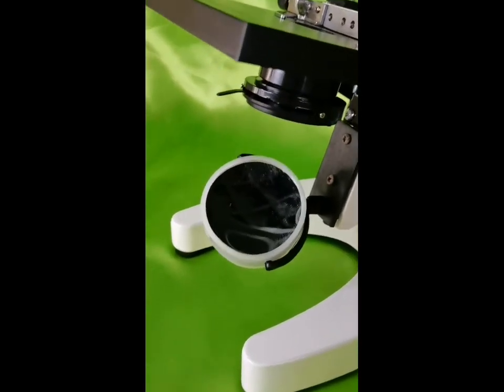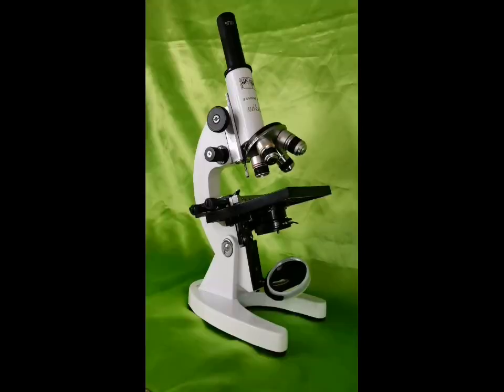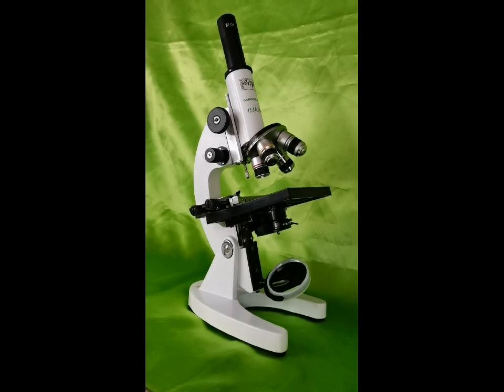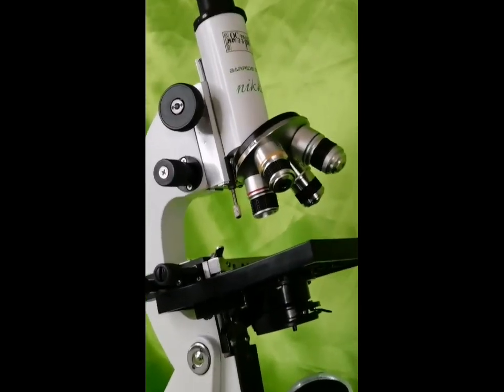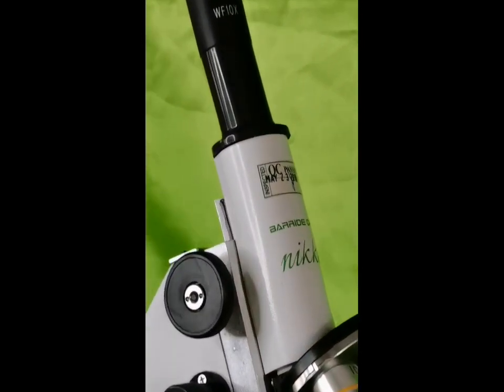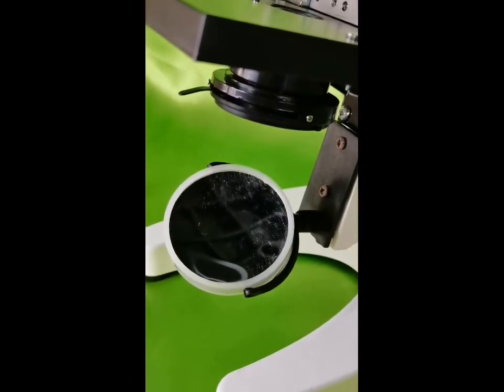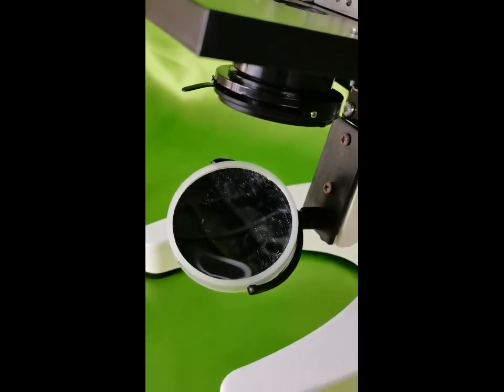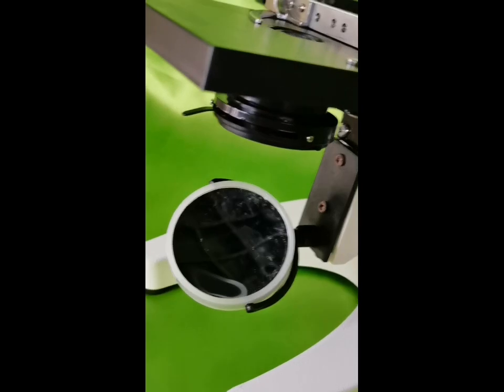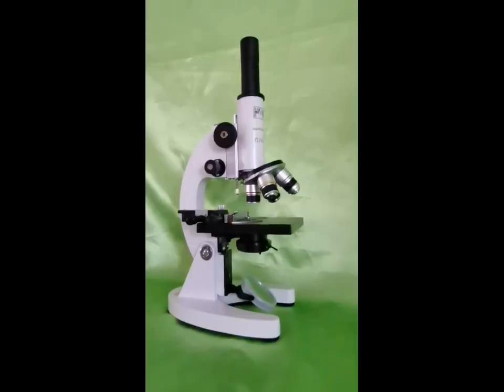in advanced research studies. The microscope is an instrument that can magnify or enlarge the image of objects that are too small to be seen by the unaided eye. There are many kinds of microscope, but the most commonly used type in laboratory work is the compound microscope. The compound microscope is also called a light microscope because it makes use of light. You should be familiar with all its parts for effective use and proper care of the compound microscope.